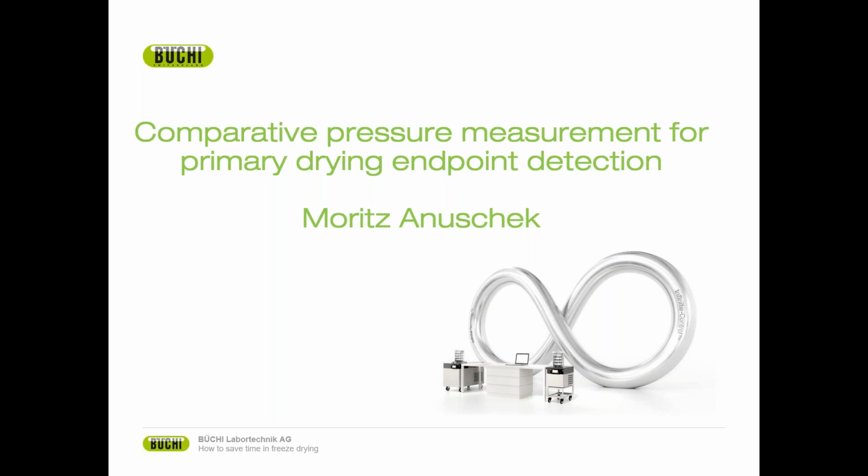So what we normally do is we use a rotor evaporator with a special Dewar bath, and then we make a cold bath with ethanol and dry ice, and then we rotate the flask into the Dewar bath and freeze it like this. This is quite a good way to do it because it's also very fast, and it can be prepared. If you have a batch, it can be prepared one day, and then you can just put your flasks into a -40 freezer and store them to the point where you want, where the freeze dryer is free and you want to run your process.